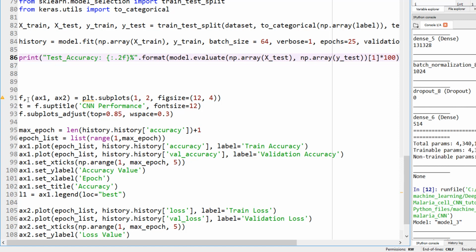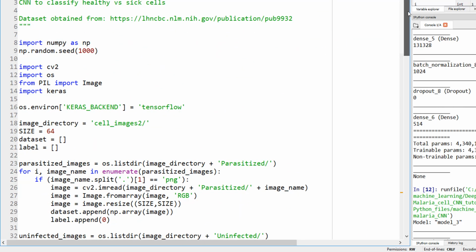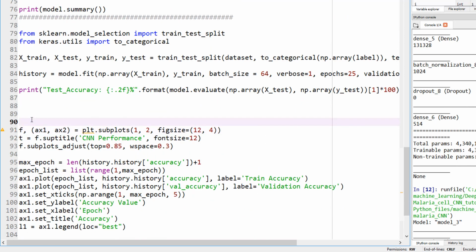That's pretty much it. And then here we are defining... what is it saying? PLT, undefined name PLT. Didn't we import matplotlib.pyplot as PLT? That's a library that we need to import. So import matplotlib.pyplot as PLT. Okay, so now that should be good.